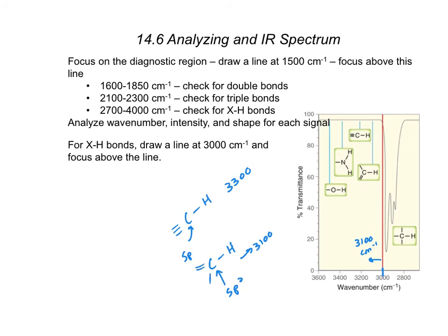A double bond, right? So that's going to be a big indicator that there's a double bond over here. And then now, at 3600, broad signal, who is that telling us about the presence of? Alcohol, right? So if you find something at 3600, it's probably going to be an alcohol group. It's very broad. What about that 3400 to 3500?